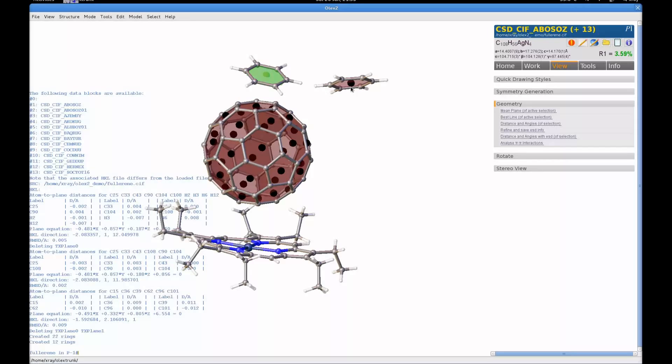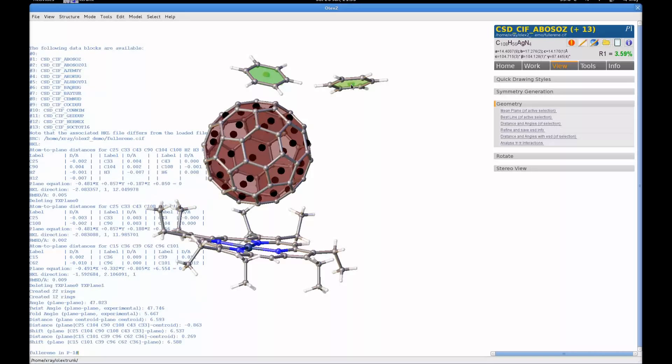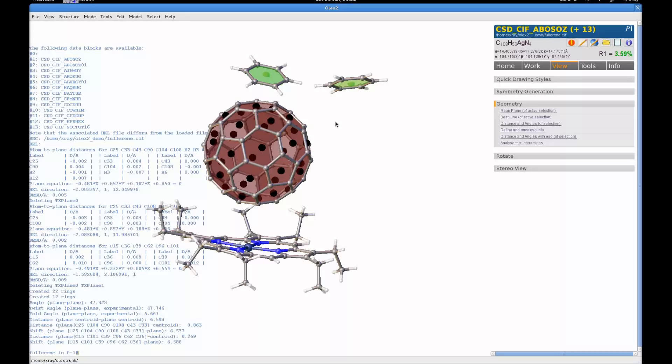I can select on two planes and use the sel command to get further information about them, such as the angle between the planes, or the distance between the centroids and the two rings. I can also use the ESD command.